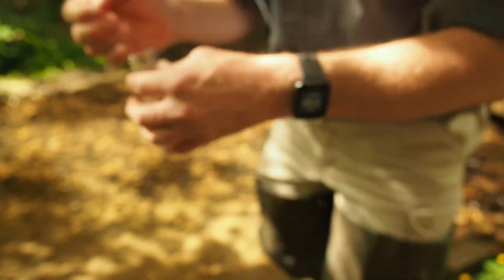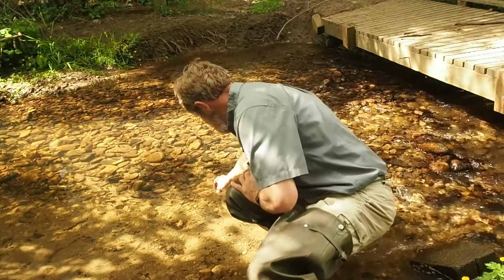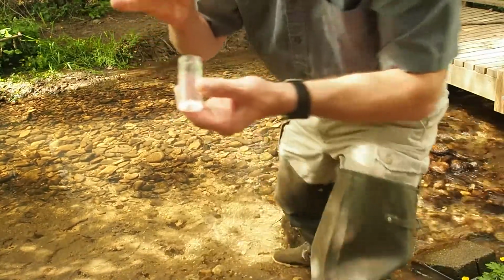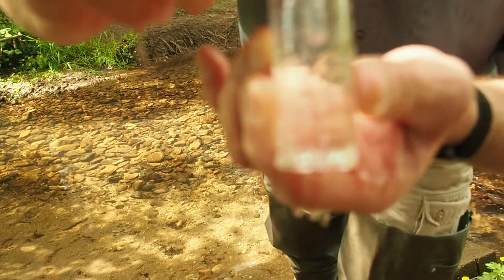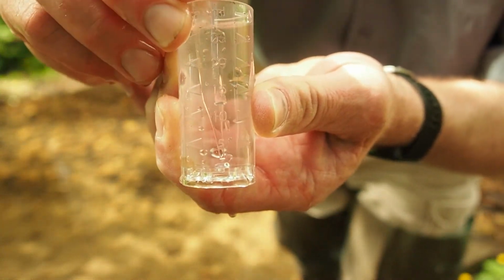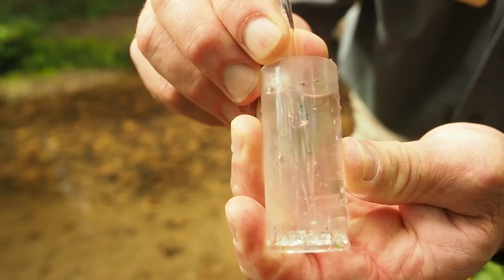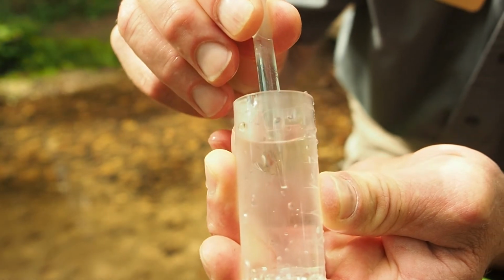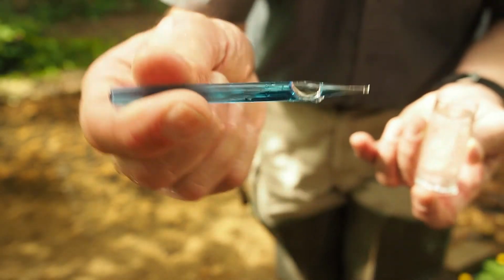So you fill the cup with stream water and immediately insert the tip of the ampule into one of those indentations, the one closest to you, and then pry the ampule back toward yourself in a way that breaks the tip off at the weakened point, using the curvature of the ampule and the side of the indentation. The ampule will immediately mostly fill with water and will start to turn blue.